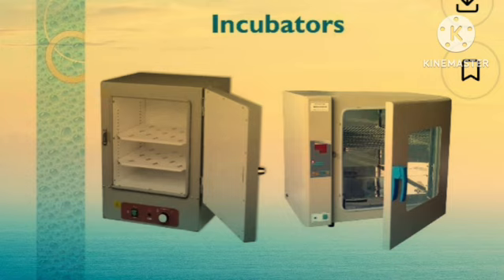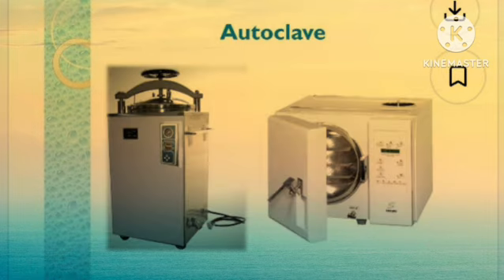This is for observation and analysis of microscopic techniques. So the essential microbiology laboratory instruments have many categories, given below. Incubators provide an insulated, temperature-controlled environment, typically 37 degrees centigrade.